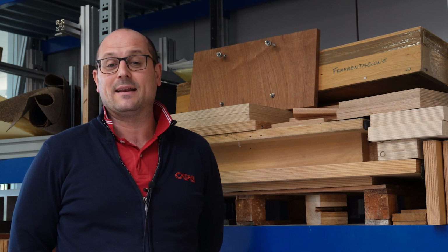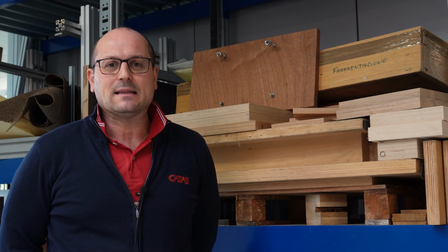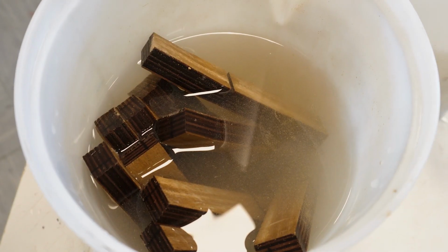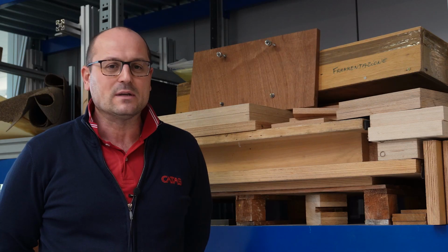Welcome back to the mechanical testing department in Catas. This is the place where we test materials. We are going to talk about the timber panels, which are at the heart of the materials used in the furniture industry. MDF and chipboard panels, as well as plywood panels, take the upper hand here. We need to characterize these timber panels.